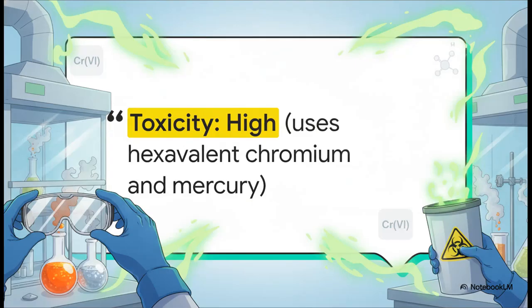Listen, before we mix even a single drop, we need to talk safety, because this stuff is no joke. Look at this quote directly from our laboratory sources, toxicity high. We are dealing with boiling concentrated sulfuric acid, highly toxic hexavalent chromium in the dichromate, and hazardous mercury compounds. Safety goggles, heavy-duty gloves, fume hoods, and incredibly strict hazardous waste disposal protocols are absolutely mandatory for this explainer.